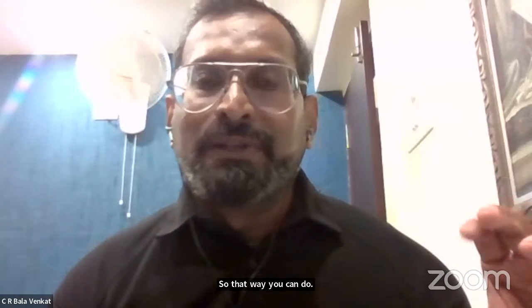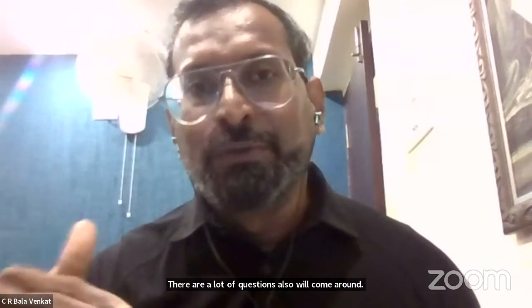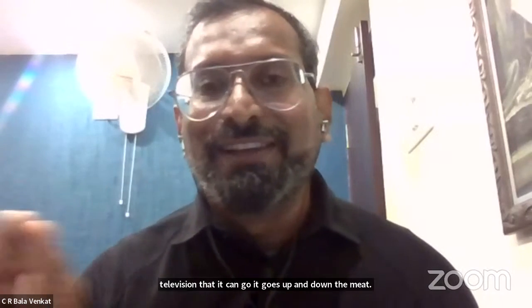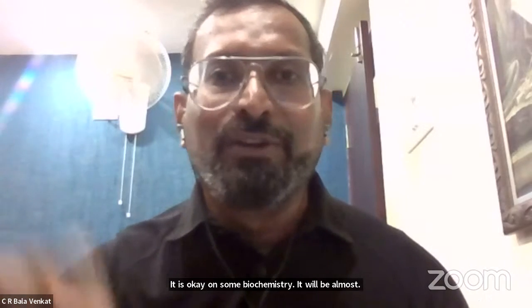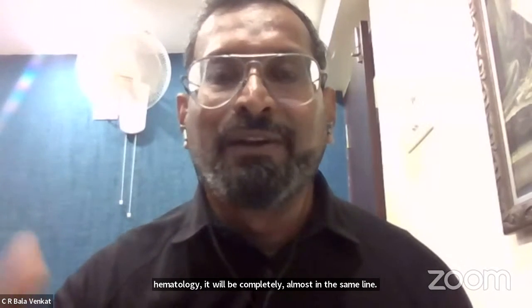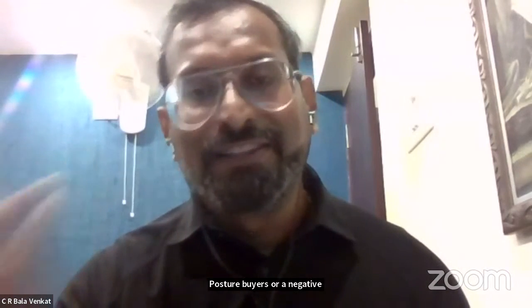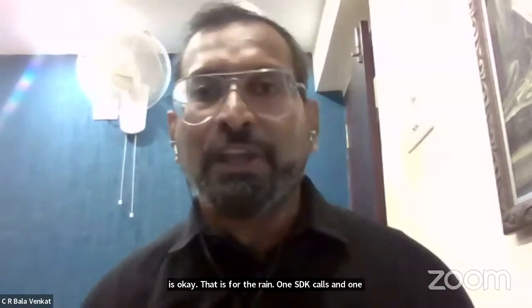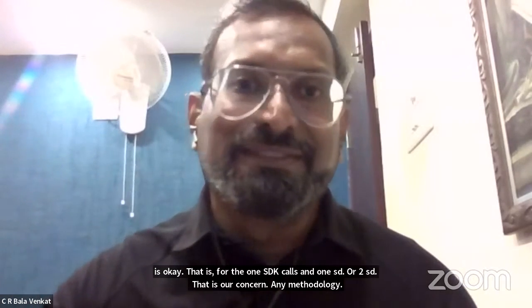And there are a lot of questions that will come around the Levey-Jennings plot, where it goes up and down the mean. It is okay. In some biochemistry it will be like that, and for hematology it will be almost in the same line. So no need to panic that it might be showing a positive bias or a negative bias, but it's not that. It is okay. That is for the range of 1 SD. It falls in 1 SD or 2 SD. That is of concern in hematology. For biochemistry, it will be a different one. It goes around the mean, up and down.